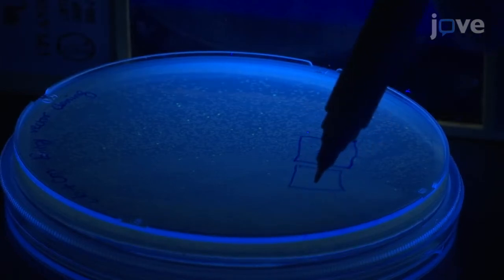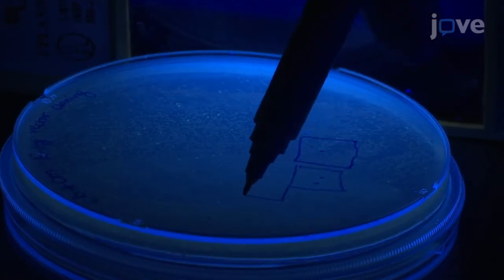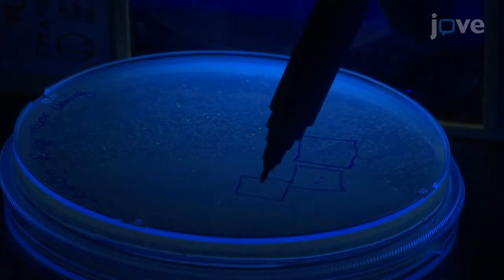The green colonies are negative because they contain the uncut parent plasmid. The white colonies are likely positive. The cloning is successful in these cases.